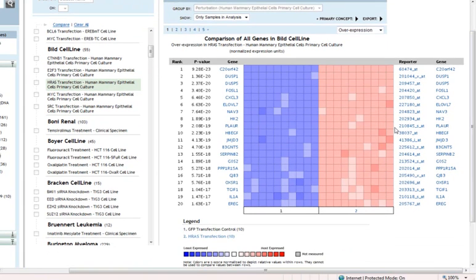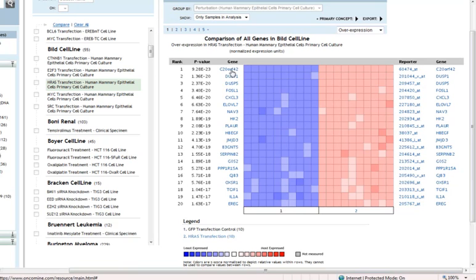So here we're looking at this analysis, HRAS transfected cell lines relative to control, and we're looking at the genes that are most significantly overexpressed in the HRAS transfected lines.